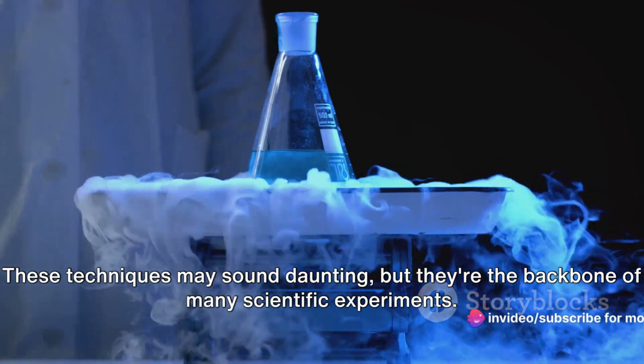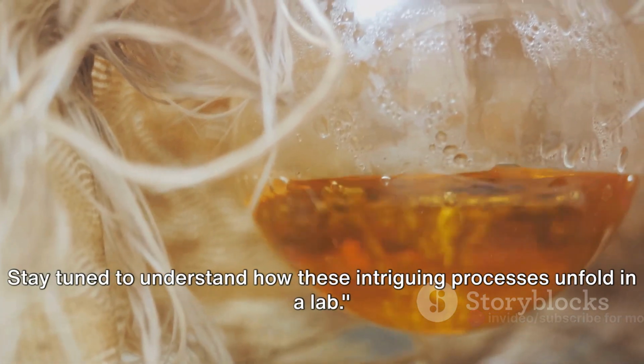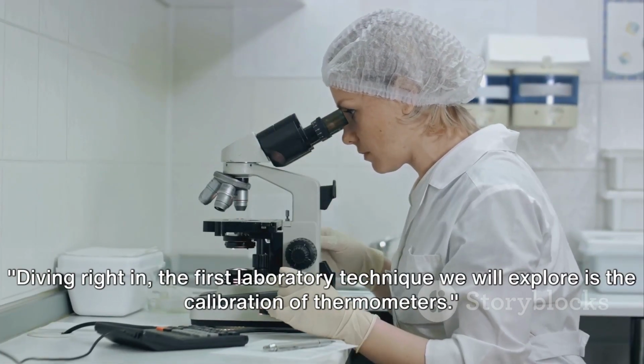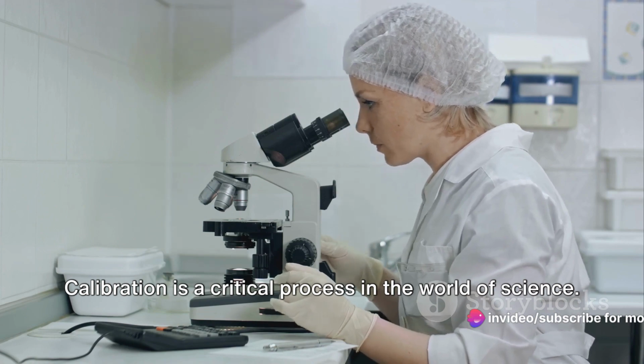These techniques may sound daunting, but they're the backbone of many scientific experiments. Stay tuned to understand how these intriguing processes unfold in a lab. Diving right in, the first laboratory technique we will explore is the calibration of thermometers. Calibration is a critical process in the world of science.